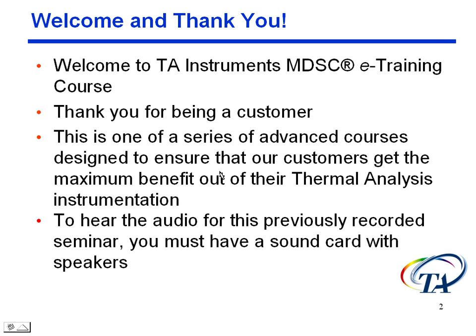Now, because this is a previously recorded course, there's a couple of things that I want to explain to you. One is, to hear the audio for this recorded course, you must have a sound card for speakers. So obviously, if you're hearing me now, you've got that, so you're in good shape. Also, because it's a recorded course, there's not a live instructor to ask questions of. But what you can do is email me questions. At the end of this presentation, there's going to be an email address, and you can send an email to that address with questions.